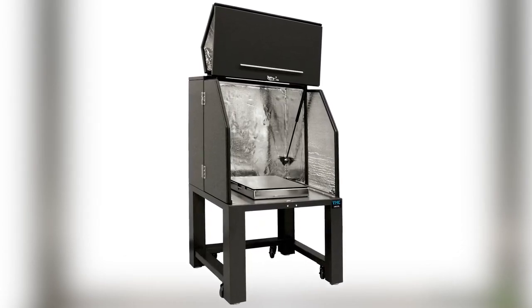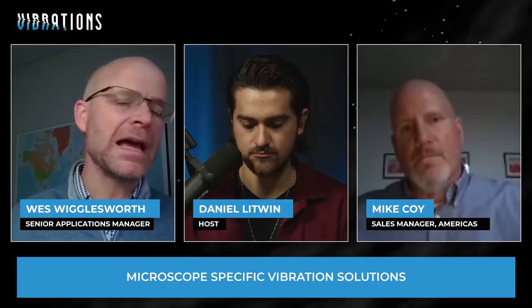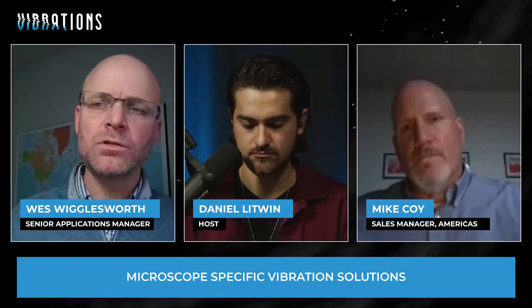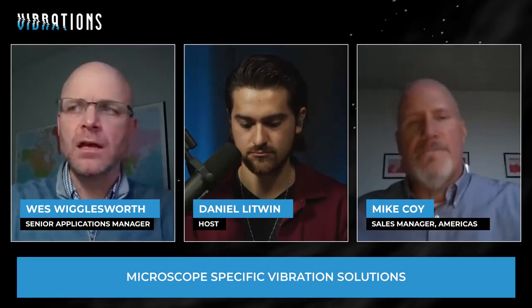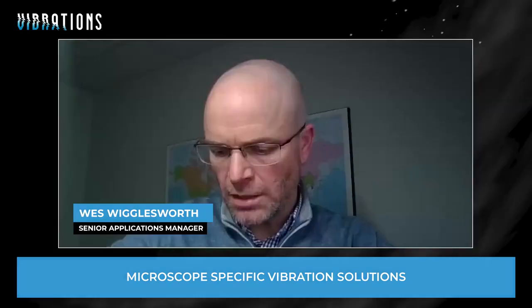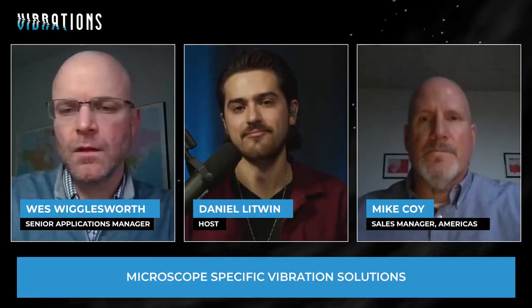Not our expertise in terms of room treatment, and oftentimes rooms are designed to be acoustically quiet. So there's different ways to approach that, each with its own set of challenges. We have experience with acoustic enclosures, typically for specific instruments. But yeah, those are both things that we consider. And when we do surveys, we measure not only vibration, but we also measure magnetic fields and acoustics.